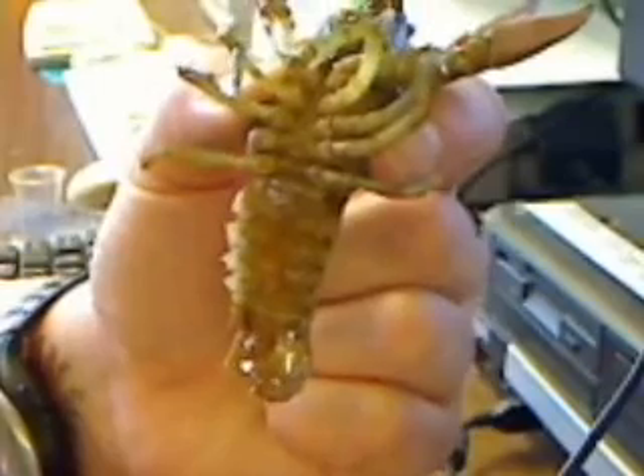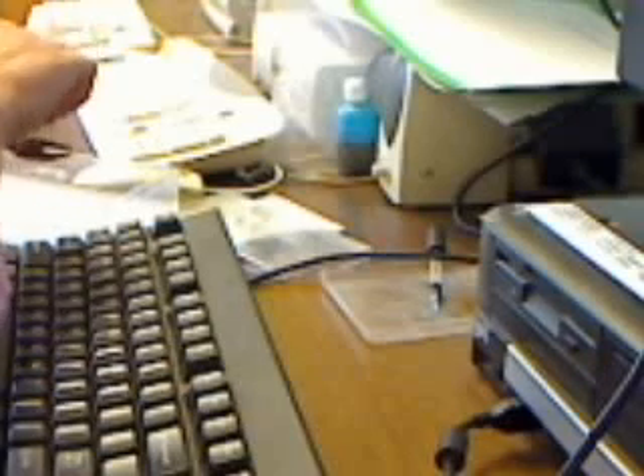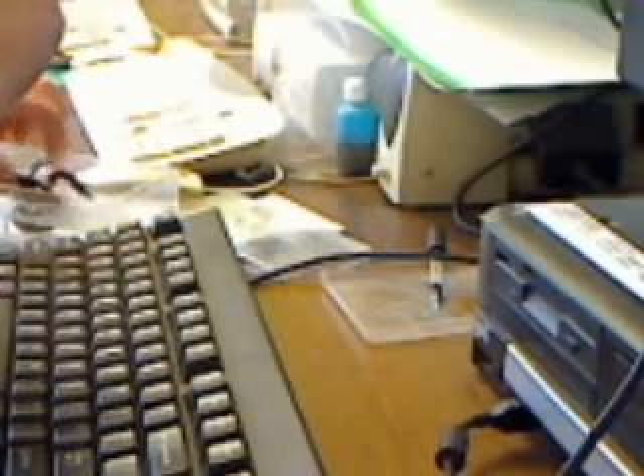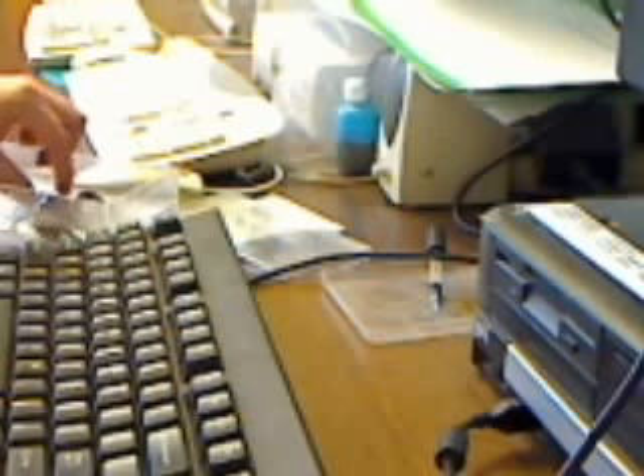I'll show you a male crayfish. He's not cooperating. I just had to thumb through it.